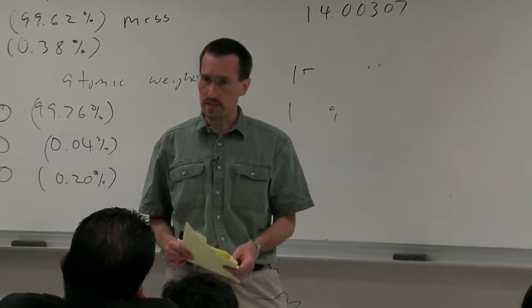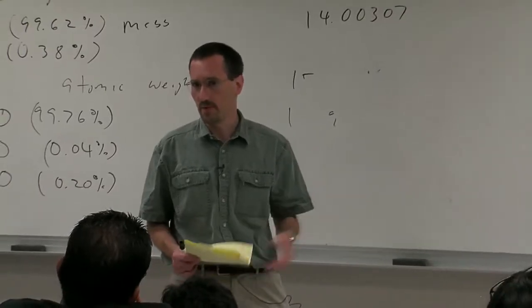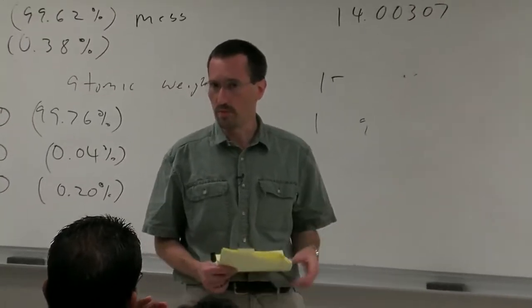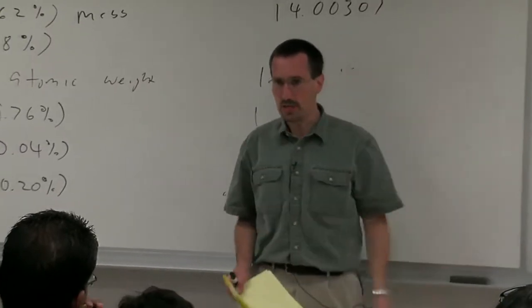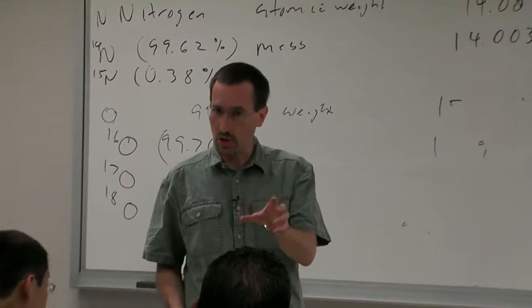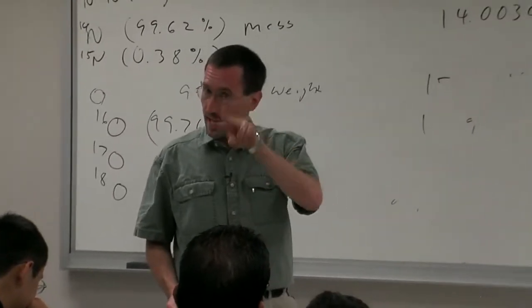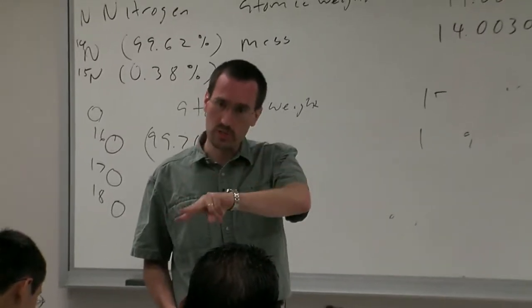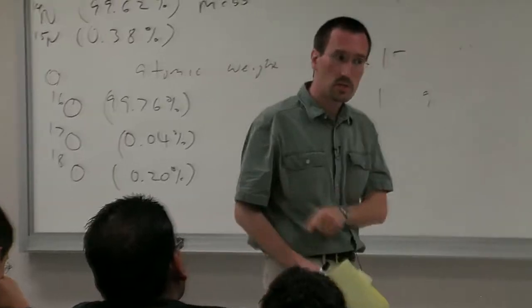So absolutely, then you need to think about adding the exact mass of sodium or potassium or one more proton on there. And if you have a multiply charged species, say with 2 protons on there, so a mass to charge that's based on being a dication, then you'd add in 2 protons or 2 sodiums or sodium and 1 proton in. Great question.